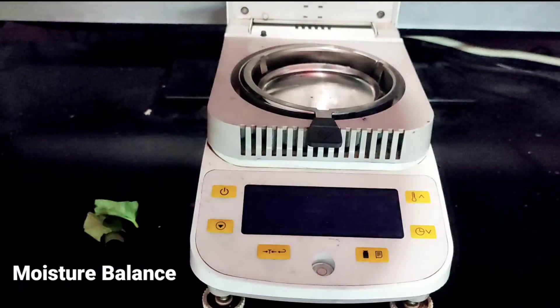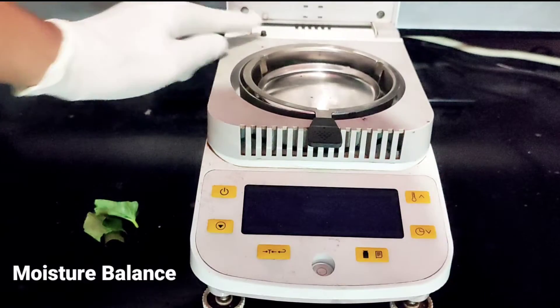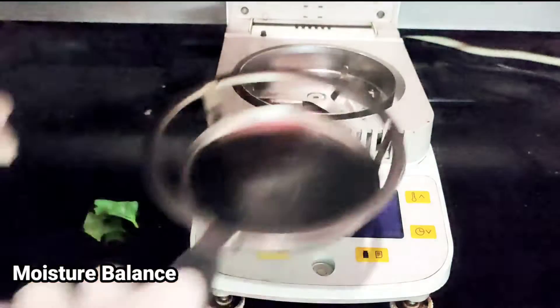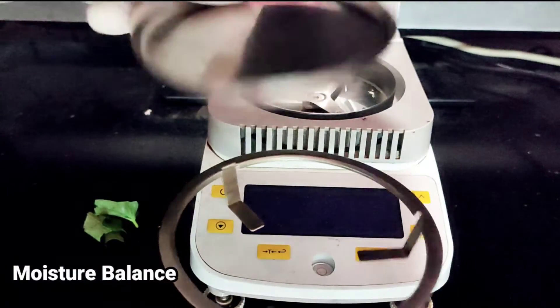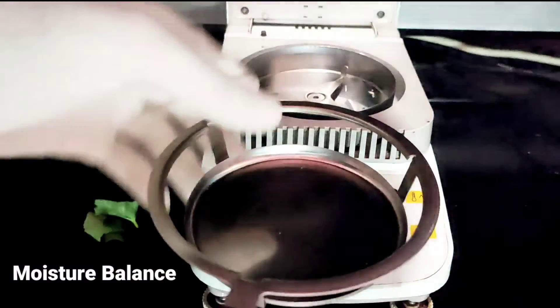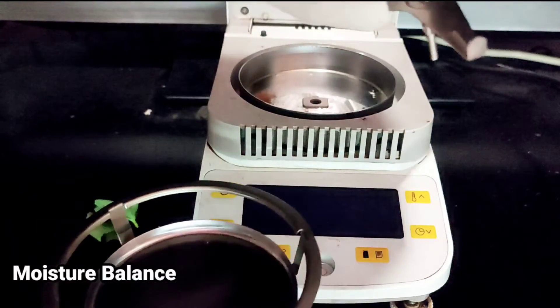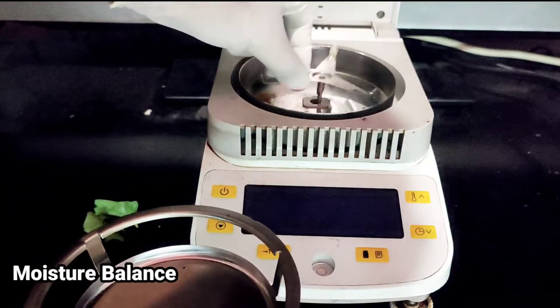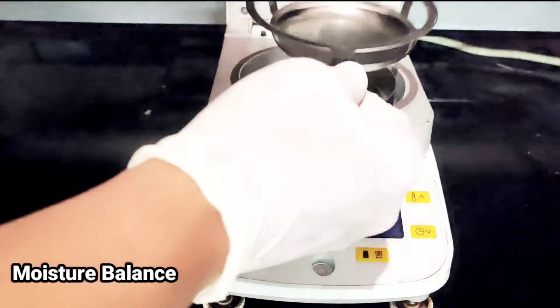Untuk fungsi-fungsinya: ini adalah untuk switch atau motor pintu. Ini untuk wadah dari tempat sample. Ini untuk timbangan racanya, nanti jadi copot.